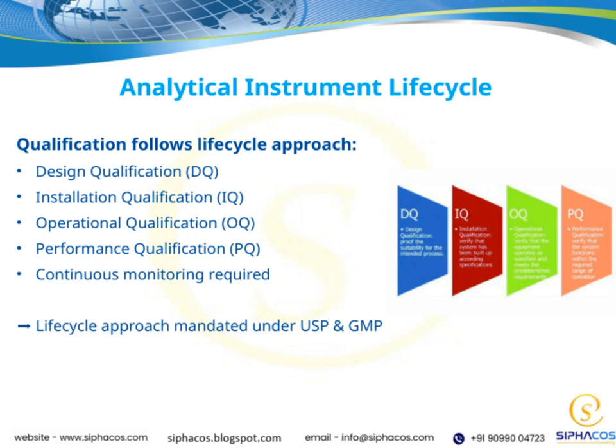But it doesn't end there. Continuous monitoring is required throughout the instrument's life to maintain quality and compliance. This life cycle approach isn't just best practice. It's actually mandated under regulations like USP and GMP standards. So, following this structured approach helps us ensure ongoing validity, quality, and regulatory compliance for our analytical instruments.